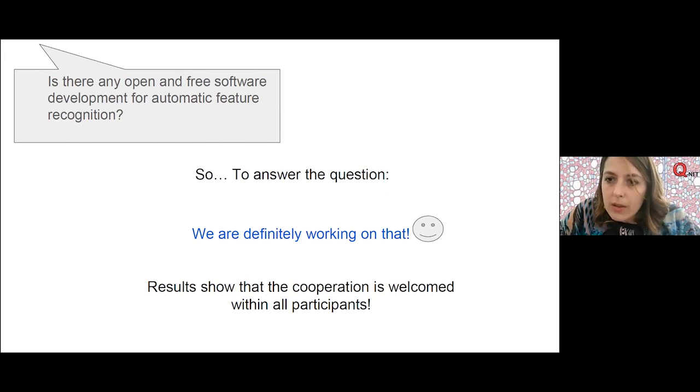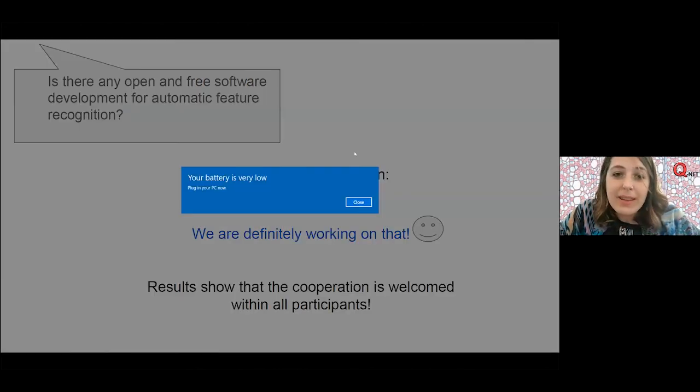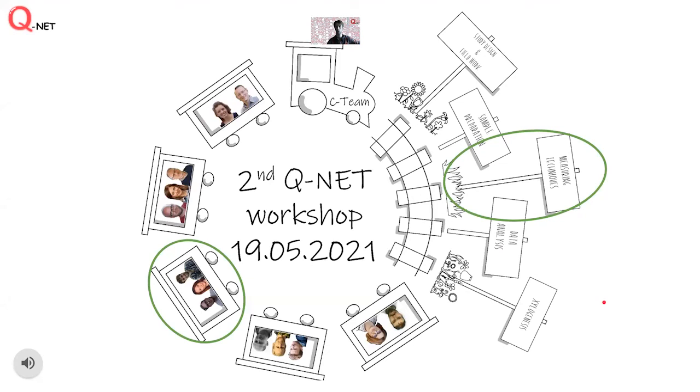The last one is concerning the micro CT equipment to scan wood cores. Did you use a readily available scanner, for example, Phoenix Nanotom? This is a very technical question. Yes. Thanks for the question. No, we didn't. All the CT systems that we use are custom built at Ghent University. But it doesn't mean that you cannot use any other system for these kinds of scans. Not at all. You can use other systems, readily available systems. Absolutely.